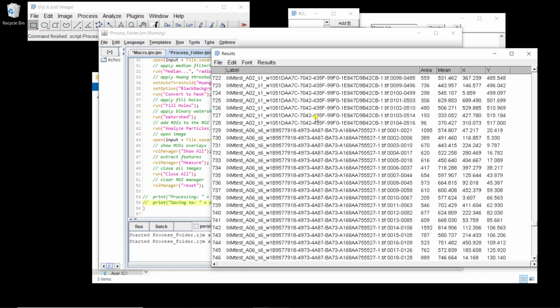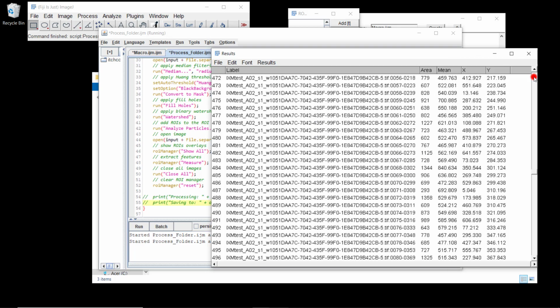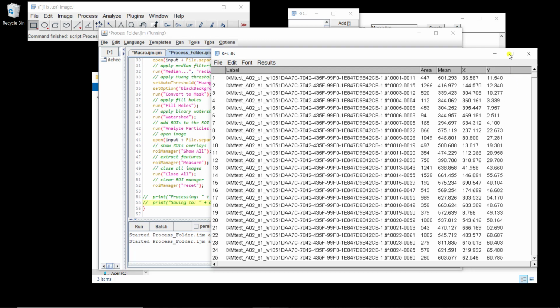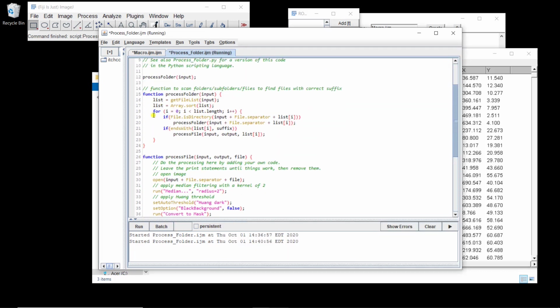So we processed the 3 images, okay? Something that we can already see is that we added all of this right after everything else. So we need to clear this when we start the file, otherwise we're gonna just add after what is already there. So if there's nothing, it's fine, but if there's already something, it's not.